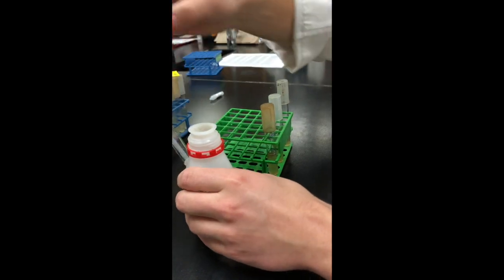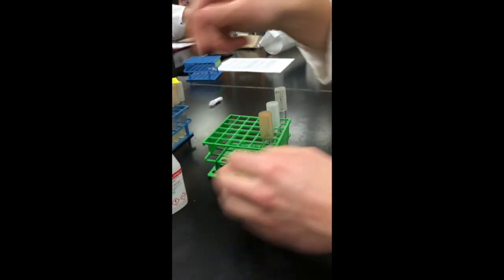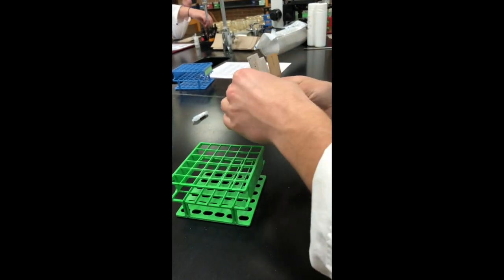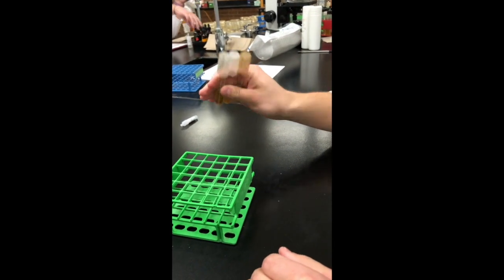Now comes the fun part where we shake gently for 5 minutes. We're going to pick up our tubes, hold them all in the same hand, and we're just going to shake for 5 minutes.